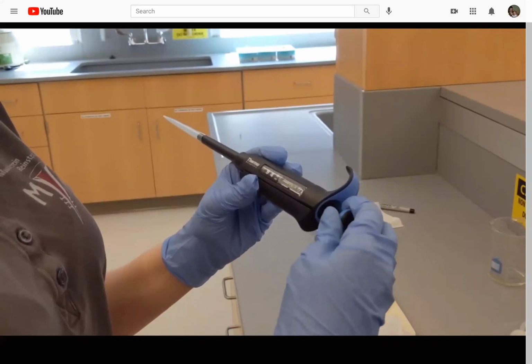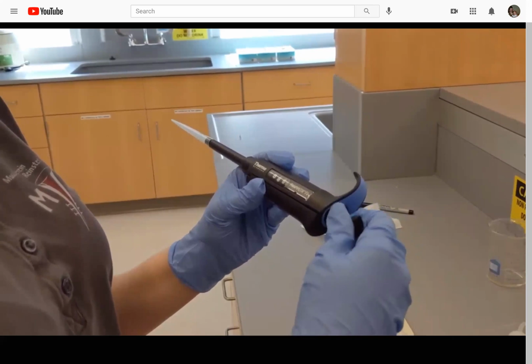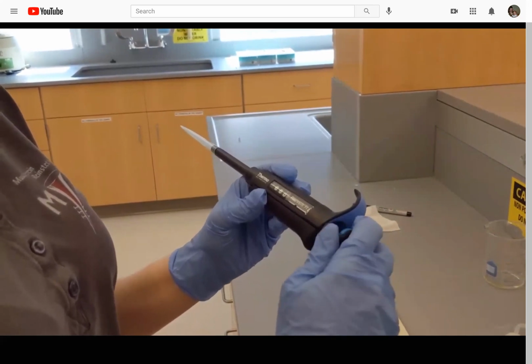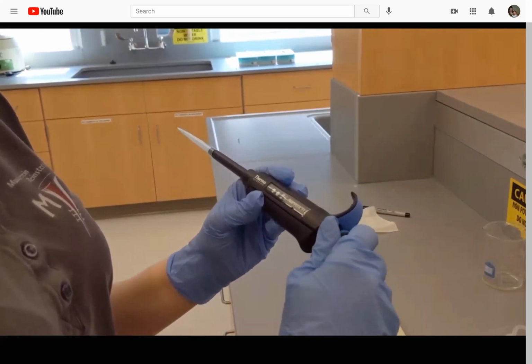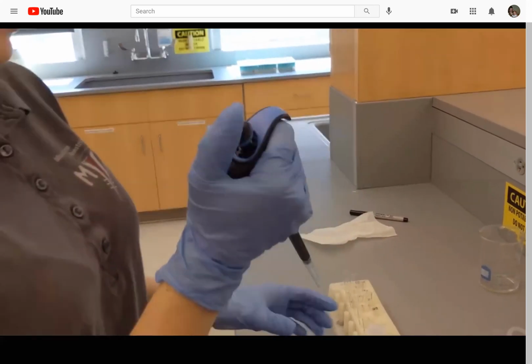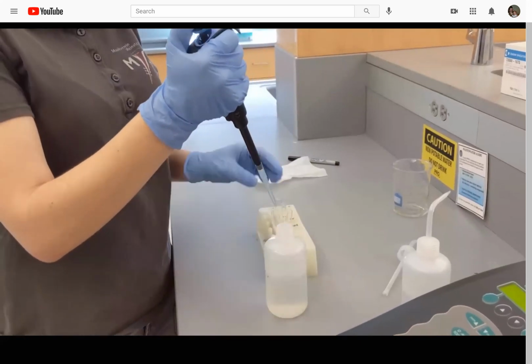So we're now going to move it down to 500 microliters, and add the 0.5 milliliters of water to all of my test tubes.